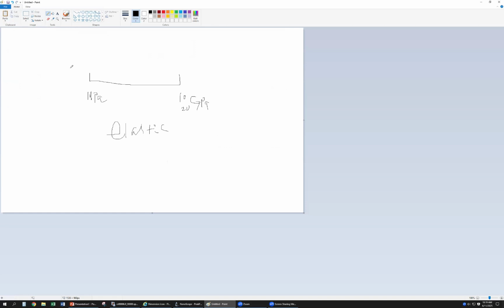Of course, someone also uses this one for the kPa, right? So if the material is elastic, we have another method. On Friday we were talking about DMA. They use this one to get the elastic modulus and the loss modulus. So that means this one has power loss.